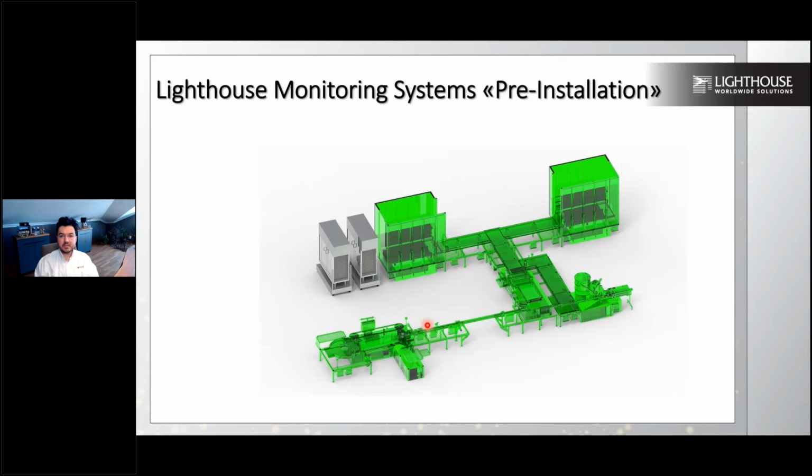But maybe there are things that you don't know anything about that just pop up from the system, then you have to investigate. But keep in mind, never ever stop your system with the data you collect without making a proper analysis. This will create another level of issues, because stopping the entire area means that you will be keeping your vials open to the ambient air. If there is an issue, you will have it worse, so that the production will be terminated.